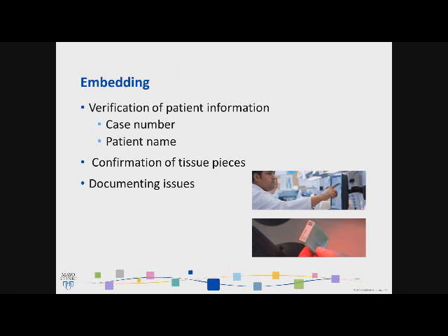The next step in the process is embedding. Actually, let's take a step back. After grossing, you go to the processor. While I don't have a slide on this, there can be additional marking steps during the processing step. Here at Mayo, we choose not to scan going from the grossing to the processing.